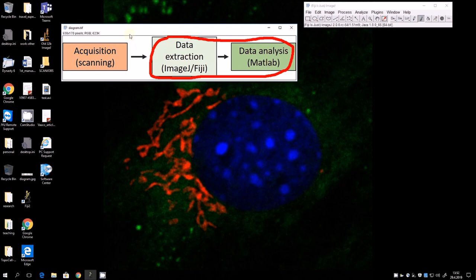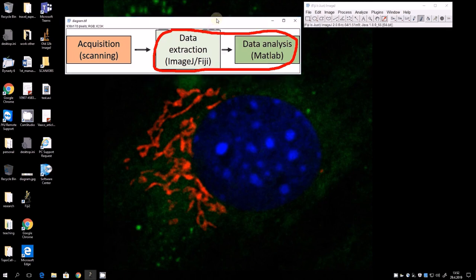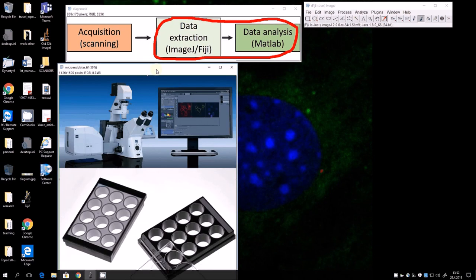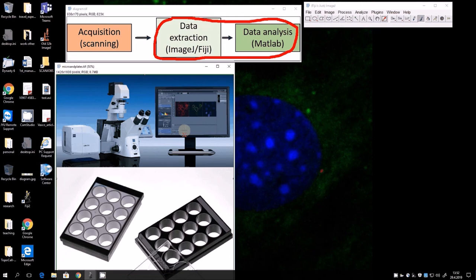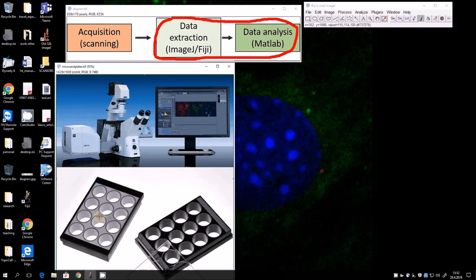There is one previous part necessary for this to happen that we're not going to cover today — the acquisition or scanning. In our case, the system uses an LSM 700, and we use 12-well plates as mentioned. With our automated stage, we can scan and tile several tiles within each well, and you can have as many experiments in as many wells as you want.